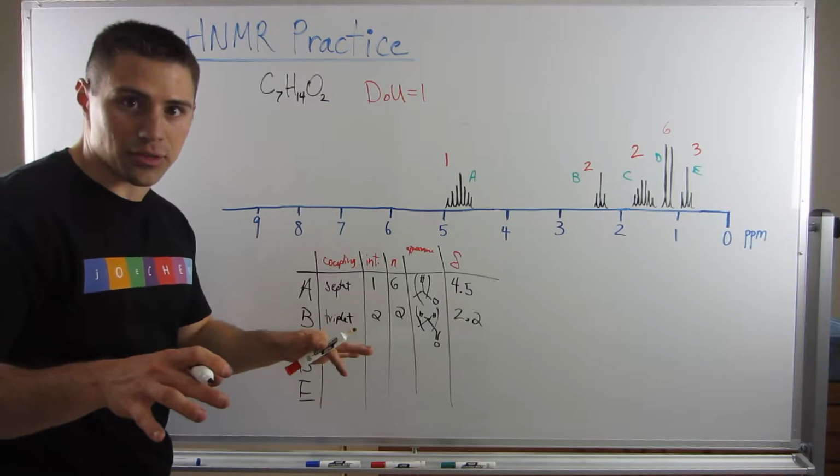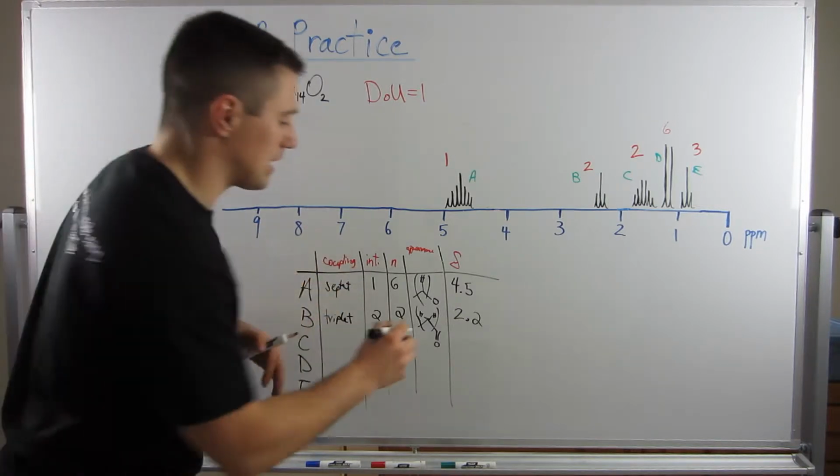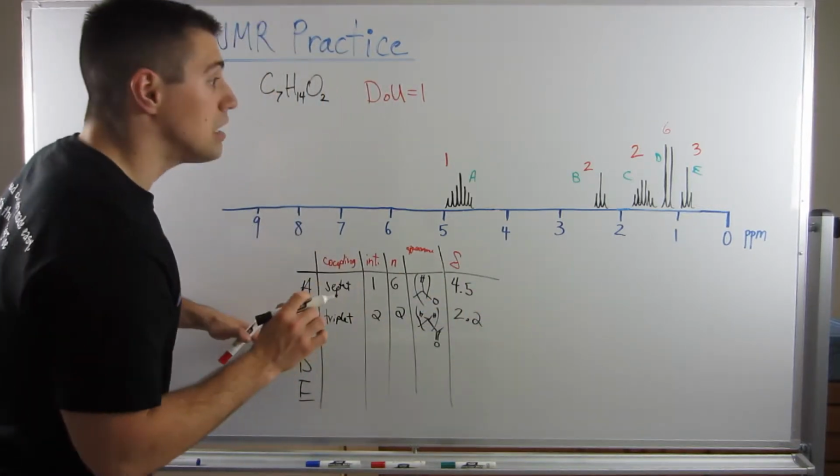Again, this is an initial guess, right? This is just something we feel might be the case. Whatever, yada, yada, yada. Okay, C.